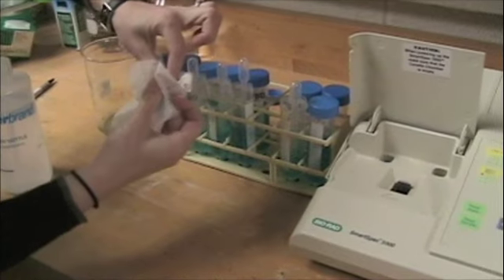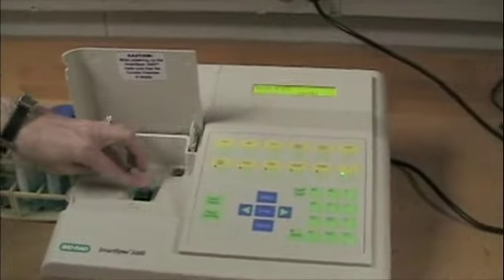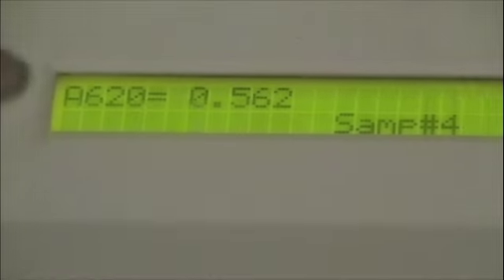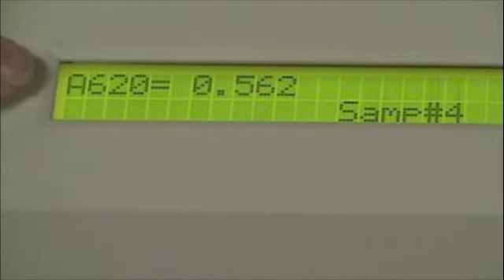Make sure I don't have any fingerprints. Make sure the clear side is facing out. Press read sample. Here is the absorbance for sample number 4.